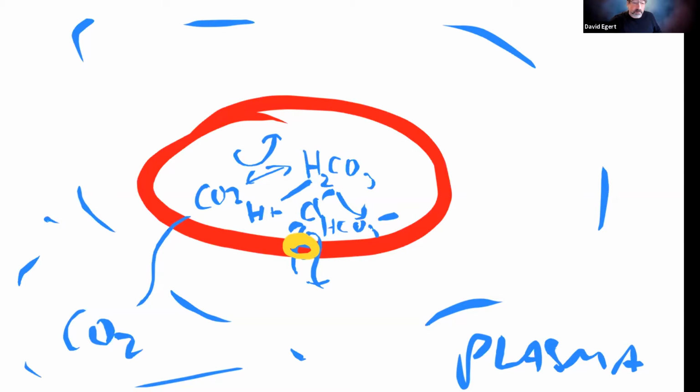In fact, one of the interesting things about ammonium chloride is it will selectively lyse the red blood cells, but not the white blood cells, because white blood cells don't have this bicarbonate chloride exchanger. So it depends what kind of blood cell you're looking at, whether or not it's going to lyse. Be careful: it turns out that it does penetrate, but you should have a reason why it makes sense that it penetrates.